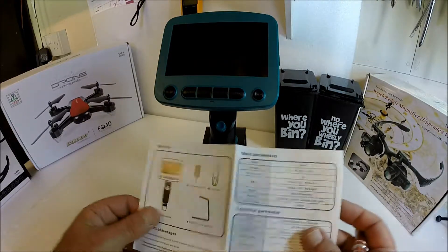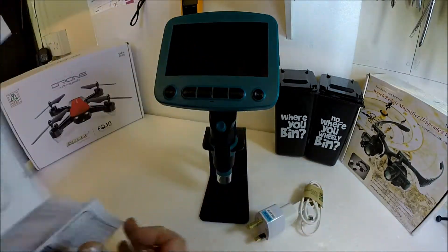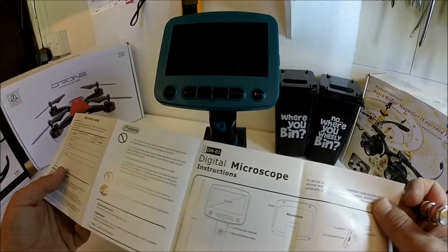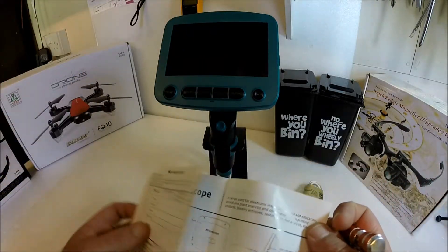The instructions are all very clear, and they show you the different functions you can use with this microscope.